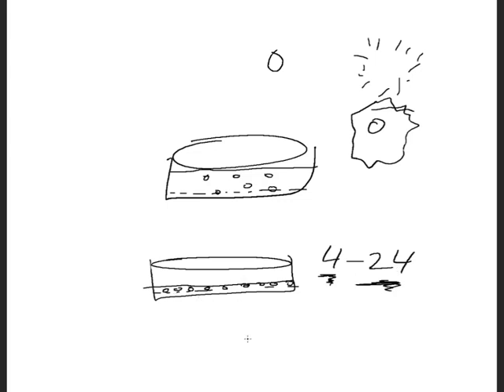The other thing about this is the cells have to be about 50 to 70% confluent. And the reason for that is they have to be actively dividing through mitosis. If you're about 90 to 100% and they're pretty much done, you're not going to get a good transformation with these micelles, because they really only allow the cells in when they go through this process of mitosis, allowing them to merge with the membrane and take in that plasmid. And so this was one of the things we were going to do: plate the cells on Monday and shoot for 50% confluency on Wednesday.